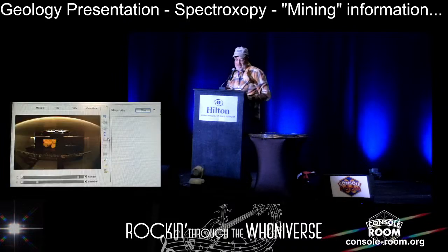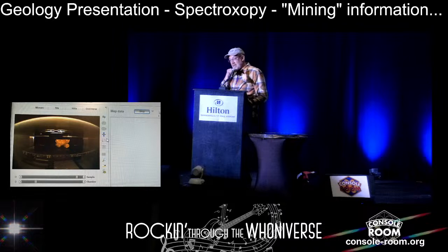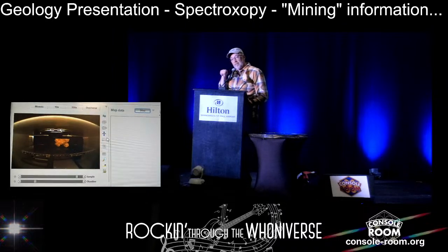I'm going to show you the inside of the instrument, and I've got a very short video clip that gives you an idea of how the sample goes underneath the X-ray beam. So there, we're just moving back to start the scan over again, but it's taking steps in the Y direction, if you will, at a distance that I specify. And in a single sample, there can be over 1,000 lines in something that's only a couple inches across.